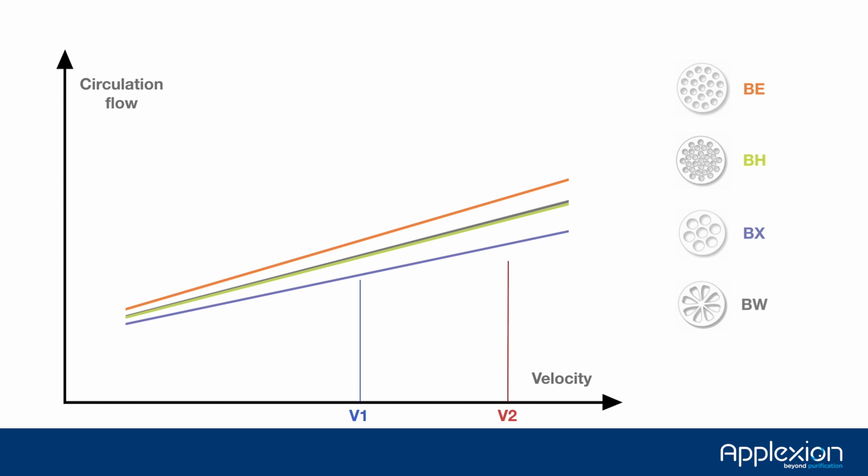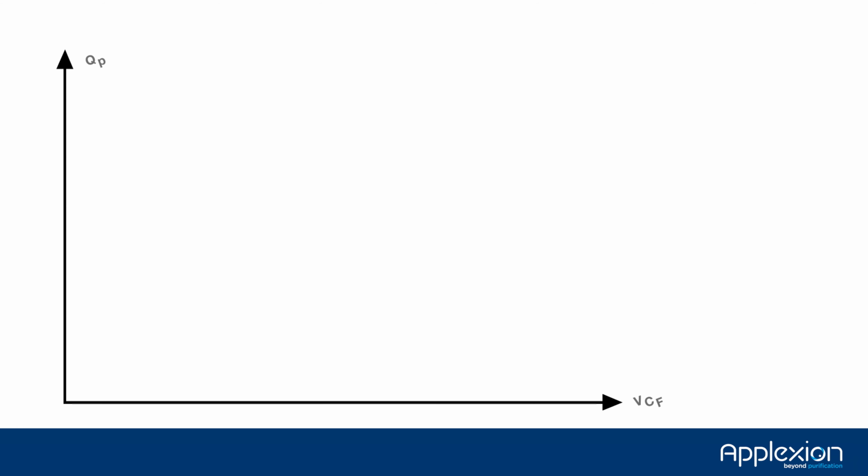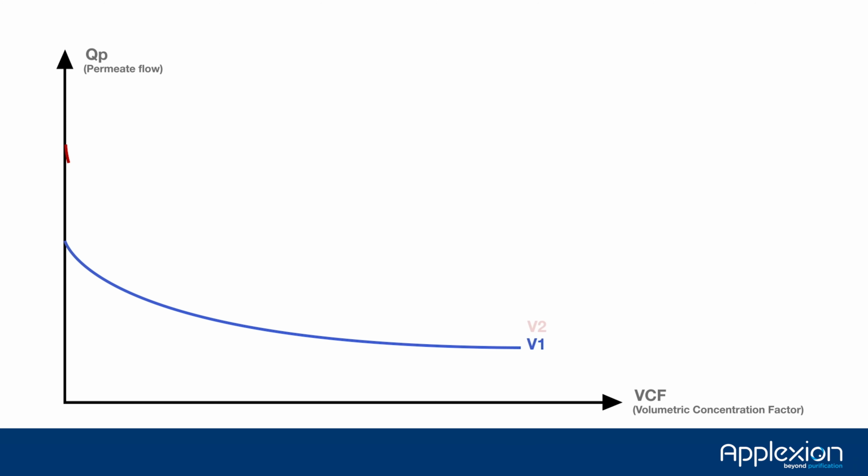Then, by studying the influence of the circulation flow on the permeation flow rate. For that, refer to the filtration curves we developed in the first video tutorial at different circulation flow rates.